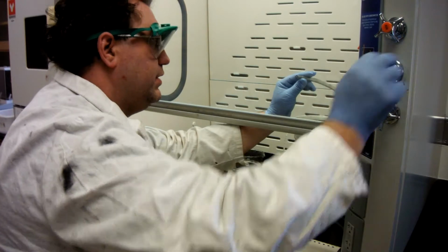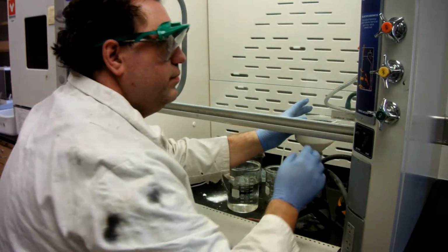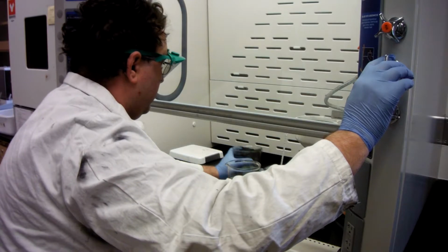Well, I made a mistake. We need to also plug our vacuum back in and then turn on our vacuum. We're getting our vacuum filtration again.